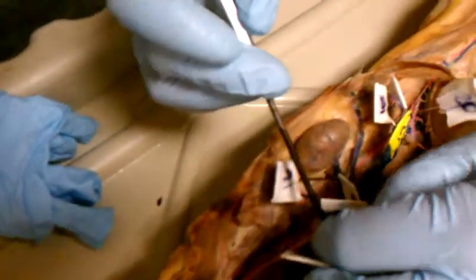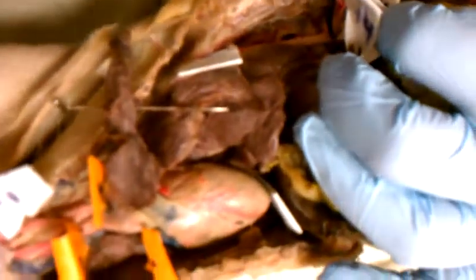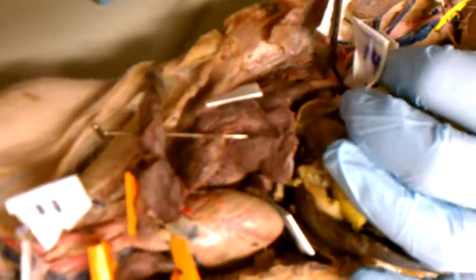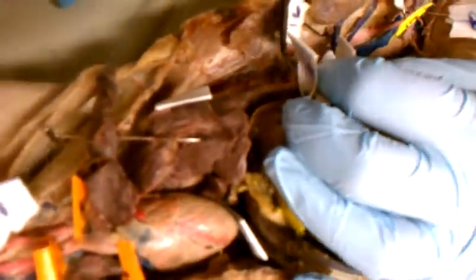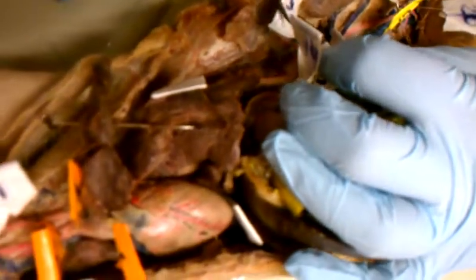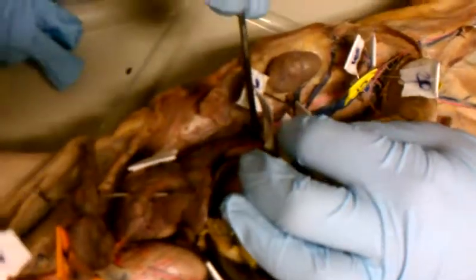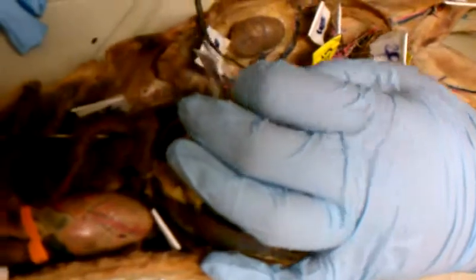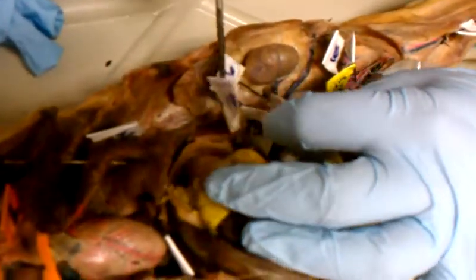This underneath, coming off underneath the celiac trunk, is the hepatic artery. It's really hard to see. There's also this little thready one coming off the top of the celiac trunk. That's the gastric artery. So there's hepatic arteries coming underneath it, and the gastric artery is coming from the top. So it's anterior.